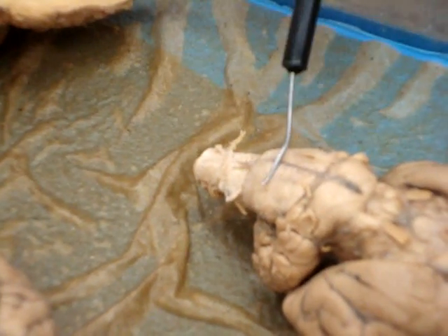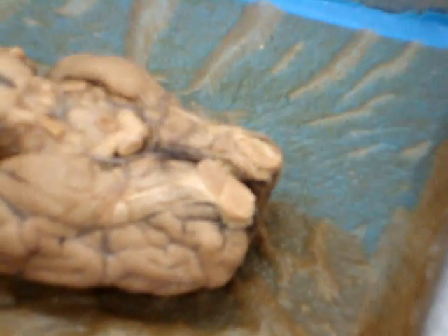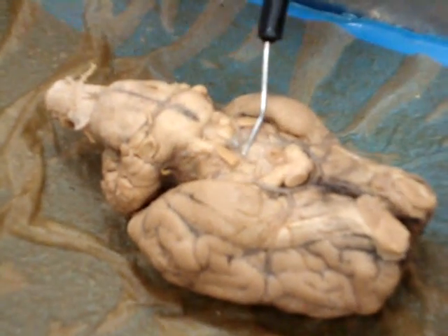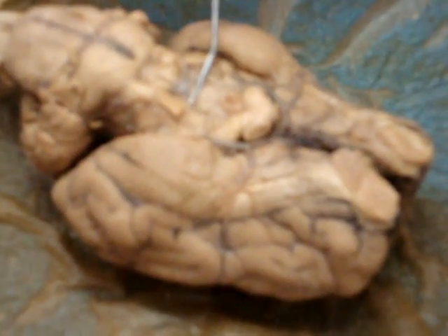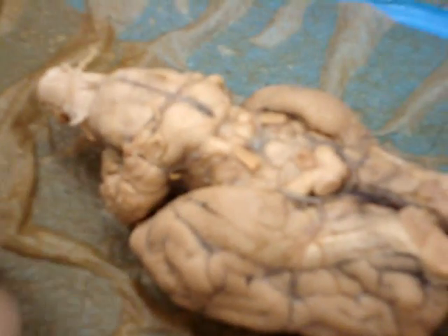All right, so spinal cord, medulla, pons, optic nerve, optic chiasma, olfactory bulbs. We did this line, we did all these sections, we did all those. One thing I left out is this little bumpy structure right there. Mammillary body. Got it. Okay, we're done with those.